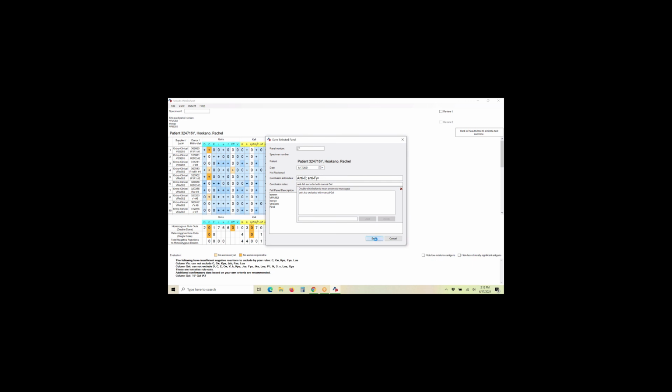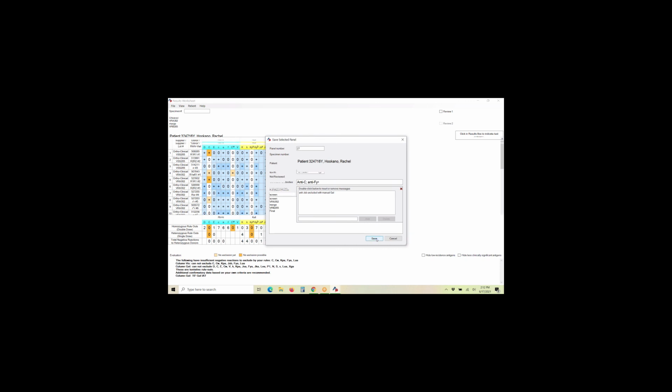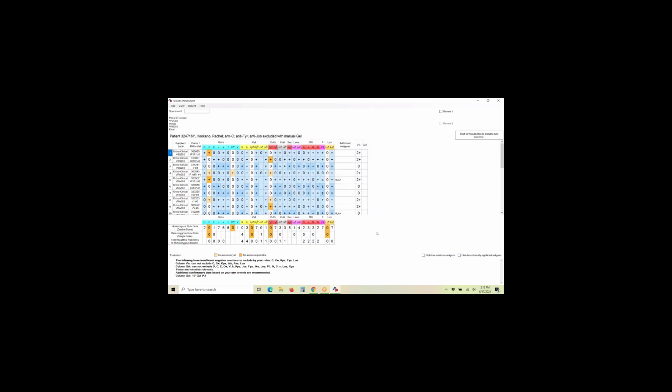And then now I put final, I can save it. And this one would be ready to send in for review. And the person would review it, and then whoever reviewed it would save it again.